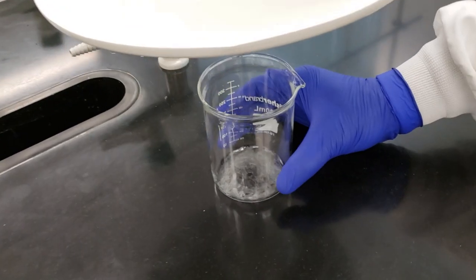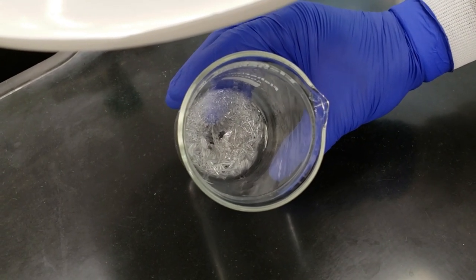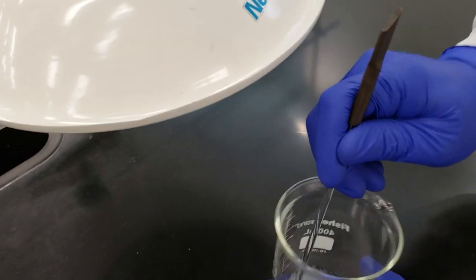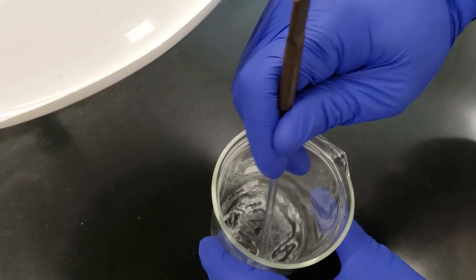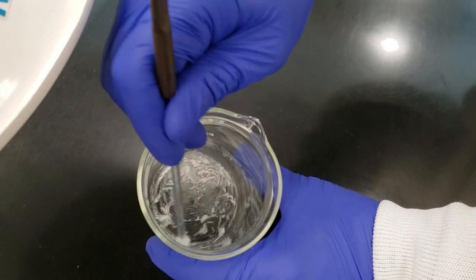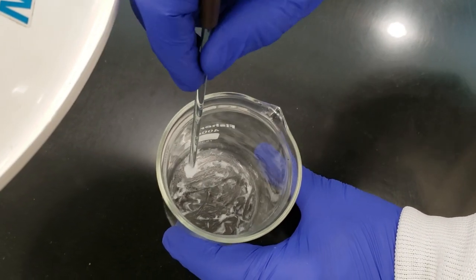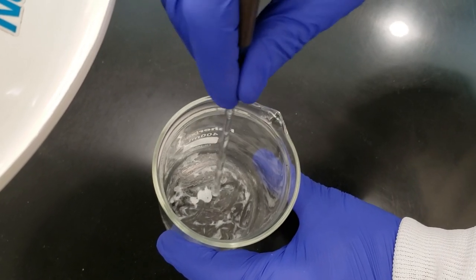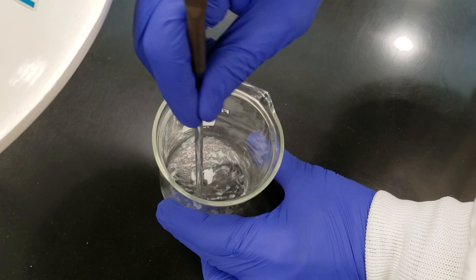So we've let our product cool in the beaker. I'm going to tilt it up so we can get a good look at how beautiful these crystals are. We're going to break these up using our glass stirring rod. They're still a little bit wet. Let me get a good angle so you can see that. So we still have a little bit of ethyl acetate in our beaker. So once we break these up sufficiently, there we go. We're going to put them into the oven so that they can continue to dry completely before we weigh them to get our final product weight.